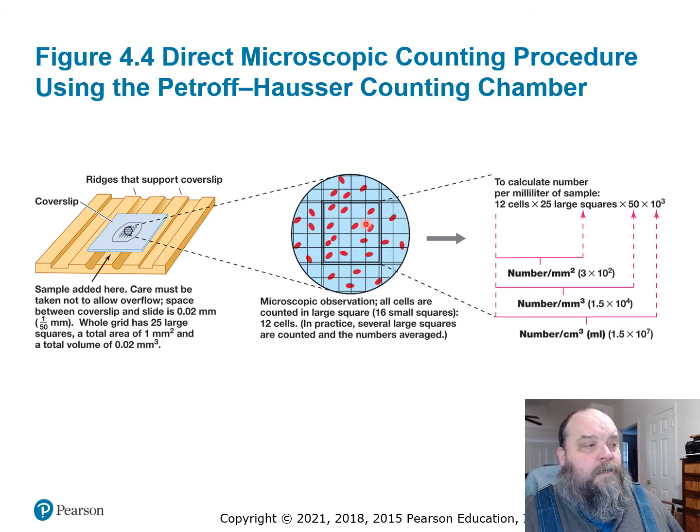The grid pattern is such that you can go through and count how many bacteria per square, individual small squares, bigger squares, and then you can back calculate. If you have this many per drop, per 50 microliters, per 10 microliter drop, you can back calculate what the total number was in the original whatever.